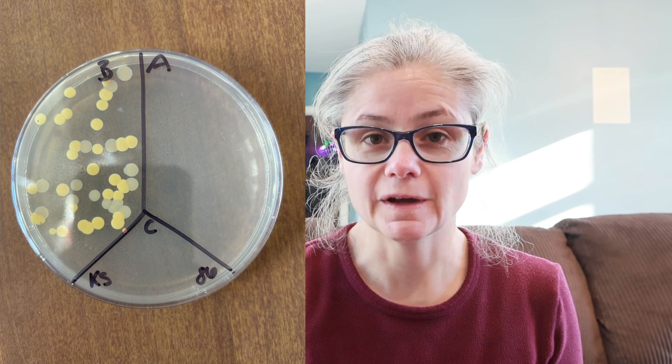Now for some results. Let's have a look at the kitchen sink. In the before section, we can see a lot of bacteria. And in the after section, there's no bacterial growth at all. So the Mr. Clean Clean Freak did a great job removing the bacteria from my kitchen sink.